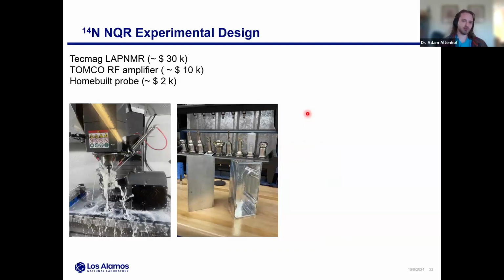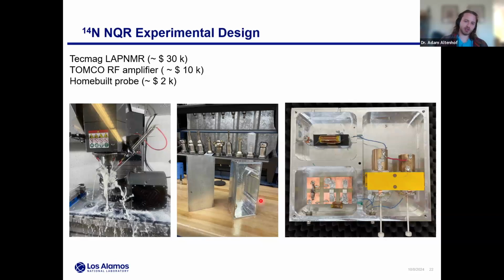And just a note on the probe design we use. So we happen to have a CNC in-house, which is really nice because we can machine these custom form factor probes out of aluminum, and we can make thick-walled aluminum RF shielding, or just get whatever form factor we want. So something closer to what we actually use is shown here. We have these different chambers, our capacitors, our Pi network, ultimately our detection area. And these aluminum walls are nearly 1/2 inch thick. So we get good RF shielding, but also it's just a really rigid mechanical system.